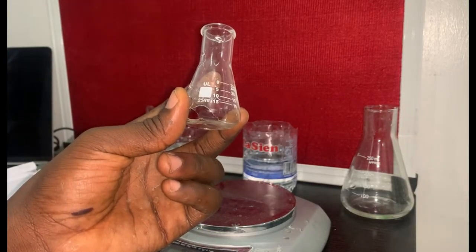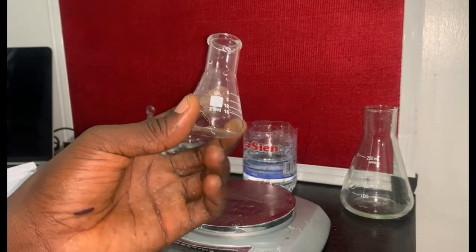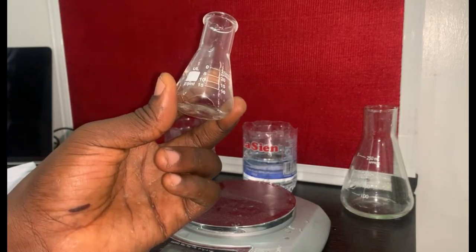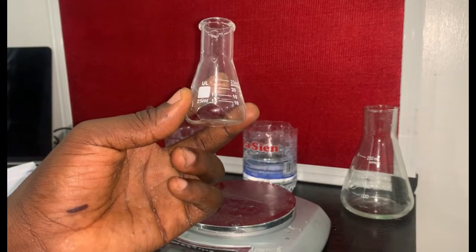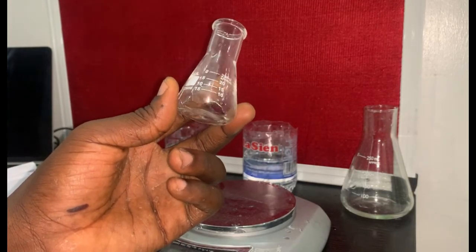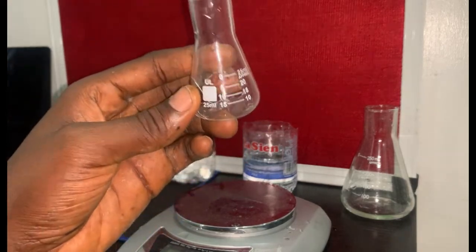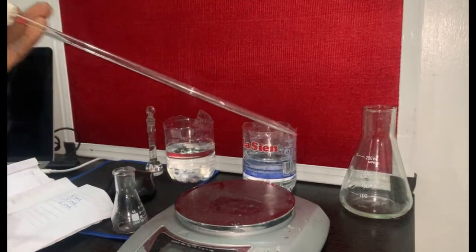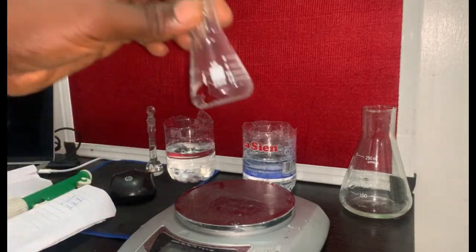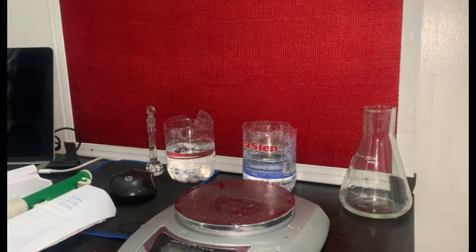I would have transferred ethanol 5 times and then subtracted the total mass minus the empty flask to get the mass for 5 times, and divide by 5 to get the average, which is still a waste of time. So instead of doing it 5 times, I'll just take one pipette of ethanol, put it inside here, weigh it, and record whatever answer it gives me in my data table.